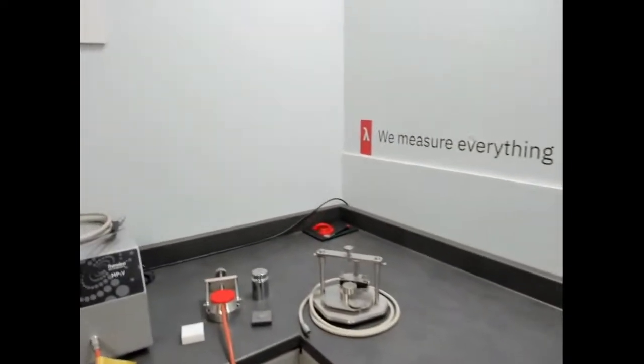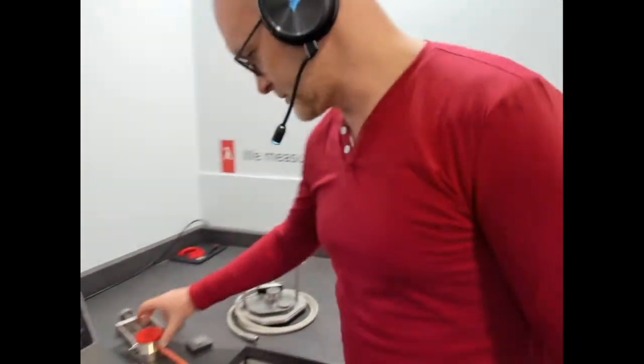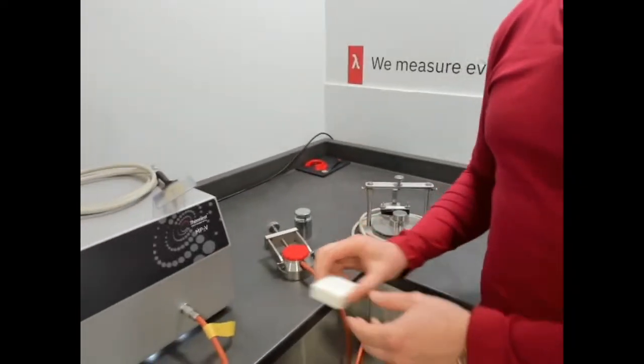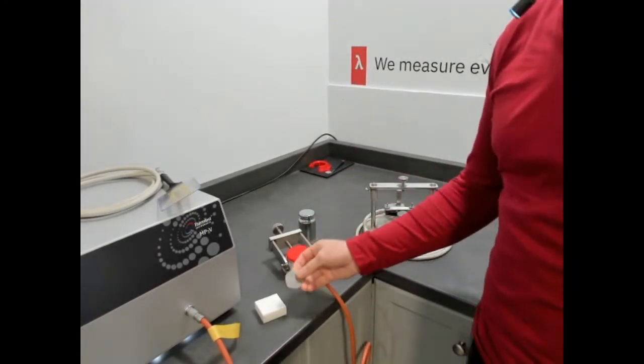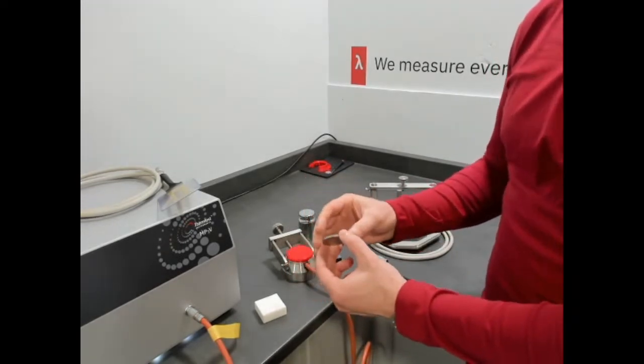So I might get on the other side of the sample and make it a little easier for me to show that. So this is the bulk sample. We'll be showing basic setup, but on the experiment we'll actually be demonstrating an asymmetric experiment on a piece of material that we would describe as slab. What is a slab sample?